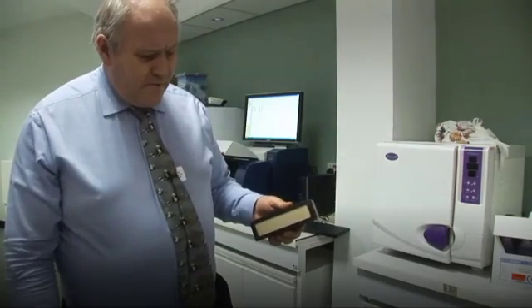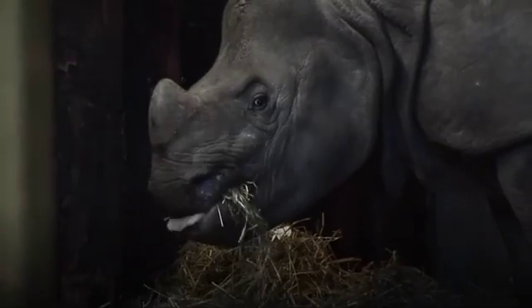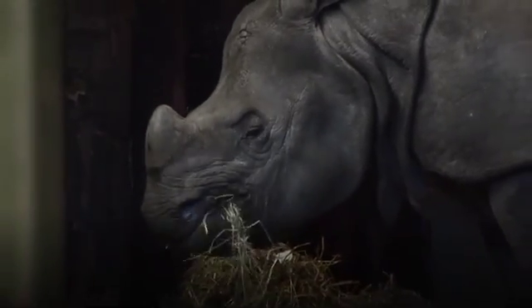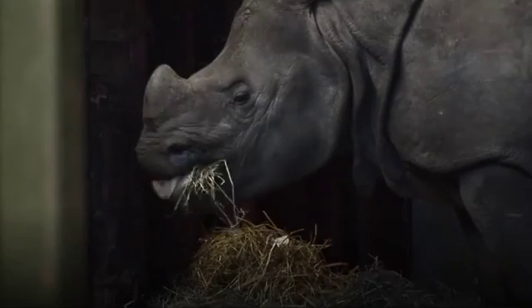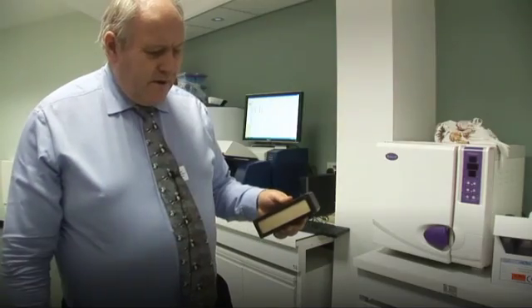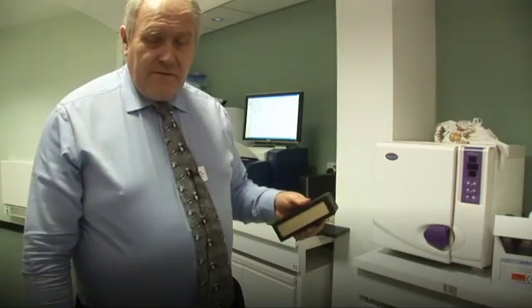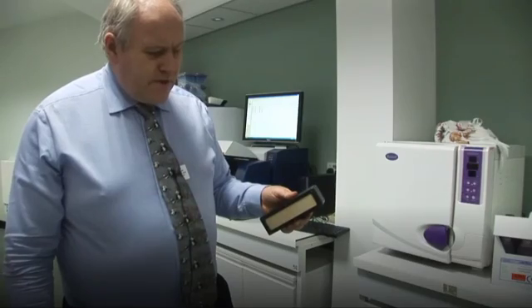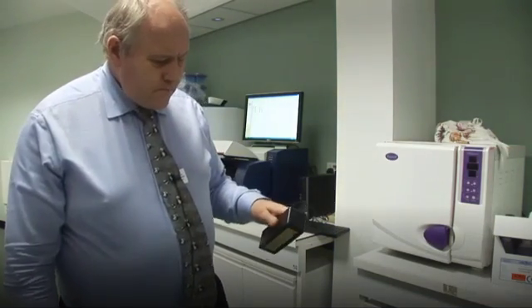The reason this is important is that pellets and things made by manufacturers do have a declared nutrient profile, but things like hay, forage, and browsers have a variable nutrient content, and often this is actually the biggest unknown variable in the diets of animals kept in zoos and wildlife parks. By using this technology we're actually able to have an idea of the nutrient value of the main forage material, which in turn means we can tailor-make the amount and content of any manufactured pellet more suited to the animal's overall daily needs.